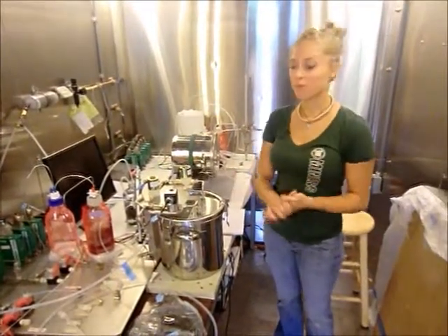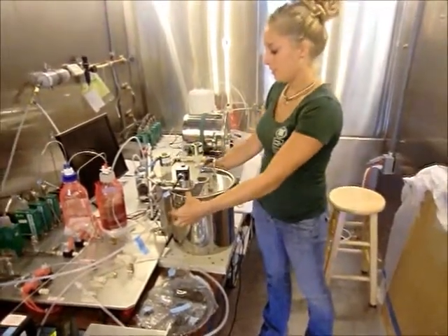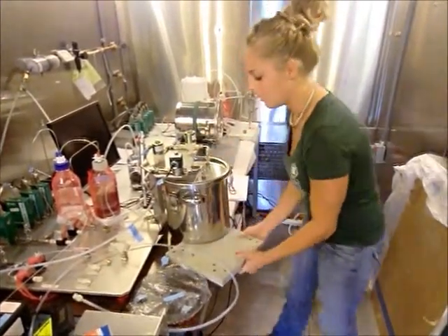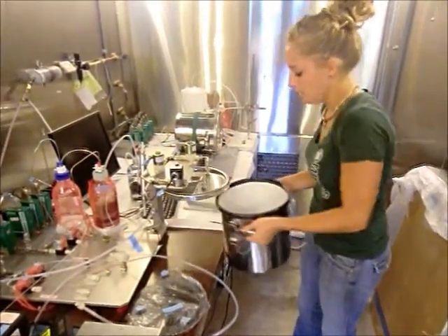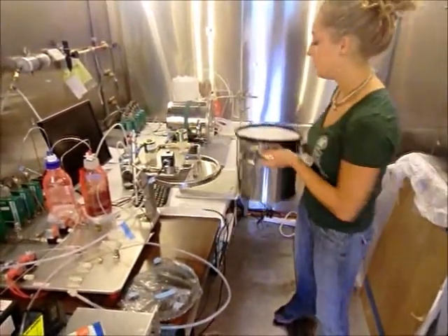Okay, so the first thing I do is load a sample. To do that, I unhook the clamps that hold the lid to the chamber pot. I take out this little stand. Right now the chamber pot's empty. That's just the Teflon lining to help make it less reactive.